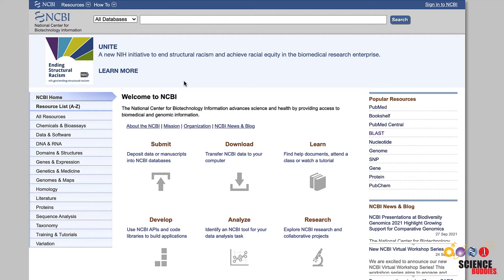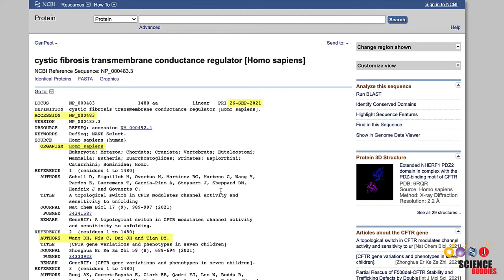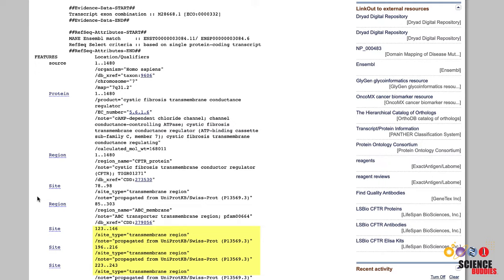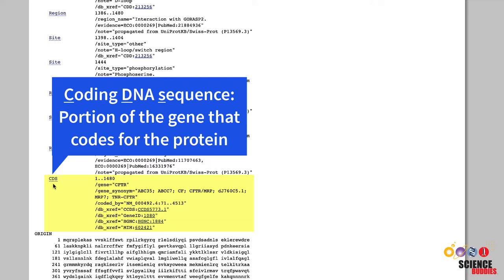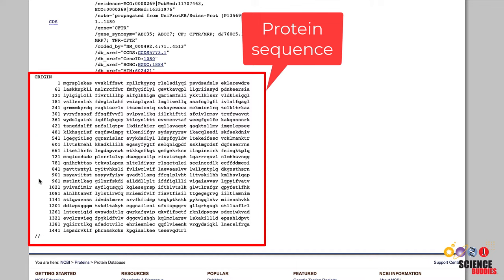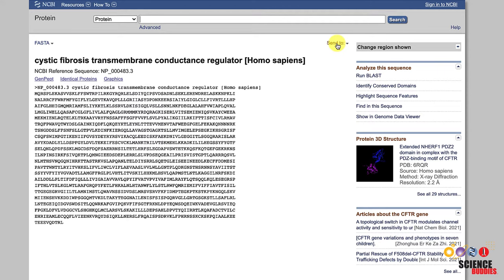If you search for a protein, you follow the same steps as before but select the protein database for your search. Let's go ahead and search for the human CFTR protein and navigate to its corresponding GenBank page. The page includes similar information as for the nucleotide sequence. In the Features section, you will find detailed information on specific sites within the protein, such as phosphorylation or transmembrane regions. CDS stands for Coding DNA Sequence and is the portion of the gene that codes for the protein. Some GenBank entries, for example mitochondrial DNA sequences, contain several coding regions, each one encoding for a different gene. At the end of the page, the protein sequence is displayed as a string of letters, similar to the nucleotide sequence. You can get the FASTA sequence of the protein by clicking the FASTA link underneath the accession number at the top. Download the sequence by clicking Send to, select File, and then click on Create File as you did for the nucleotide sequence.